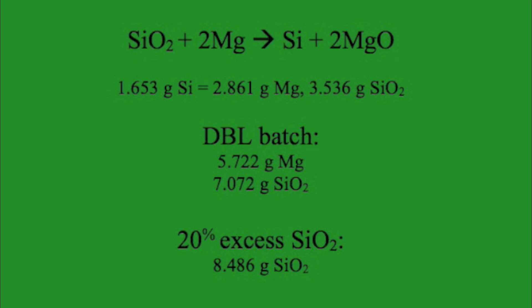I have then added a 20% stoichiometric excess of the silicon dioxide, and this comes out to a total of 8.486 grams of sand needed.